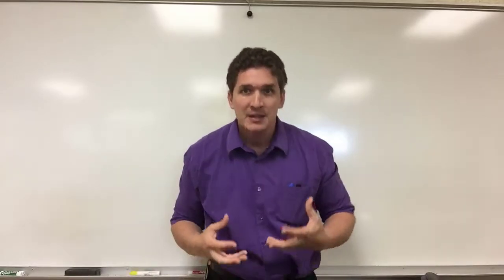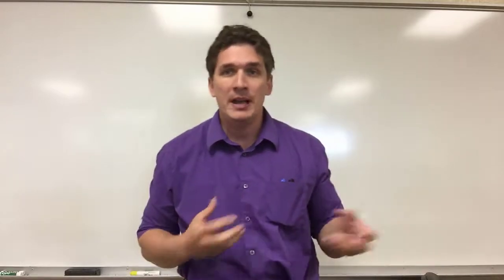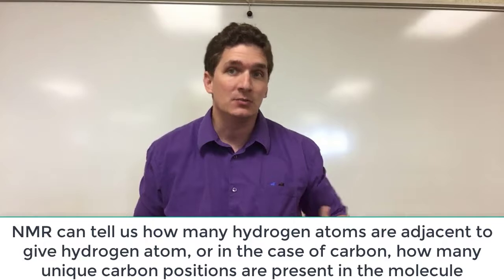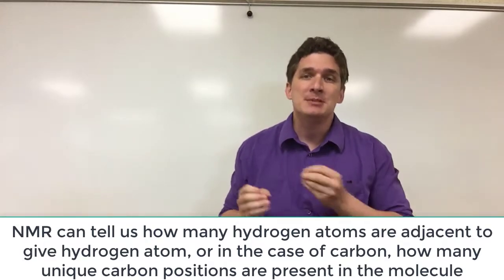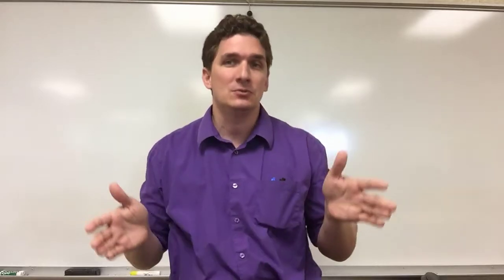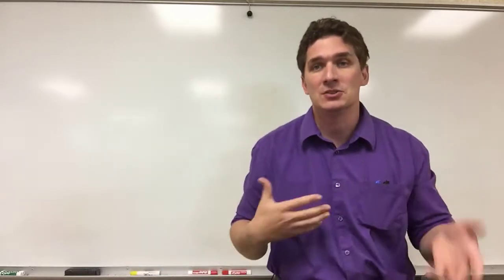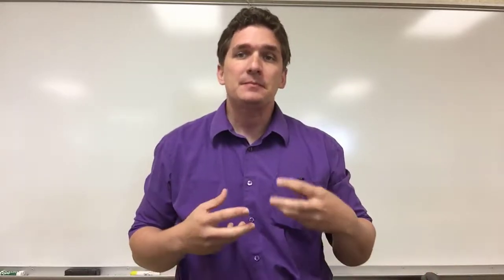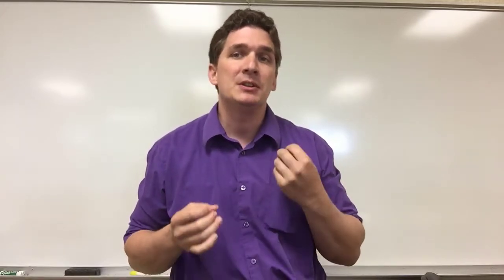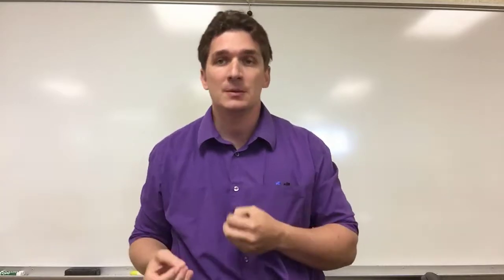inside the molecule. Specifically with hydrogen NMR, 1H NMR, we're going to try to determine the number of hydrogens, or at least their relative ratios to each other, and the different types of hydrogen. So these are going to be the hydrogens in basically different functional groups. How many different functional groups we have with hydrogen associated with it. Now, for carbon 13, 13C NMR, what we're going to try to do is determine the number of functional groups because that's going to tell us the number of carbons.